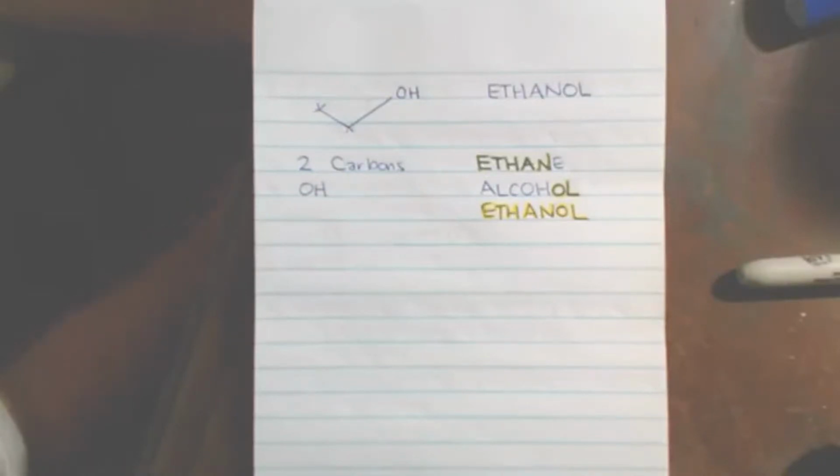But if you're going to distill it afterwards, because you really want it pure, you don't want any magnesium sulfate in there, not even one little molecule. You're going to distill it after you dry it. So you could just dry it for 15 or 20 minutes, maybe even an hour stirring. Then you're going to filter that stuff out and distill it.